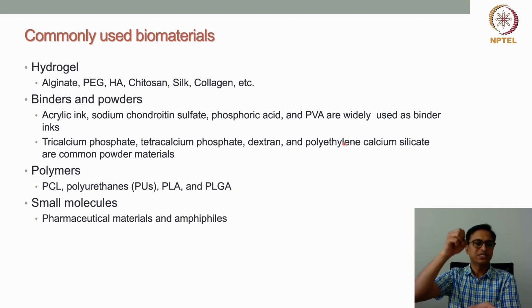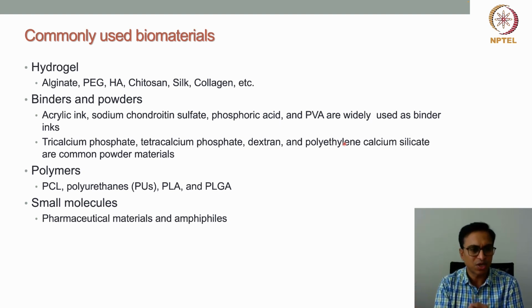The binders come out of the nozzles as droplets, and those droplets will go and stick to the powder bed, and there we control their positioning. We put them at certain locations of this powder bed. Then these binders will bind the powder material at those pre-designed locations or coordinates. In this way also we can prepare 3D structures, right?